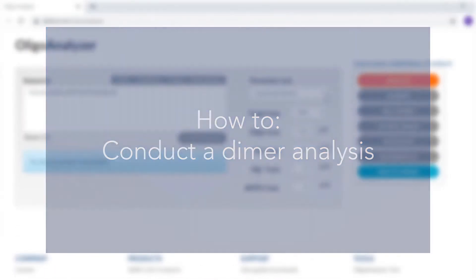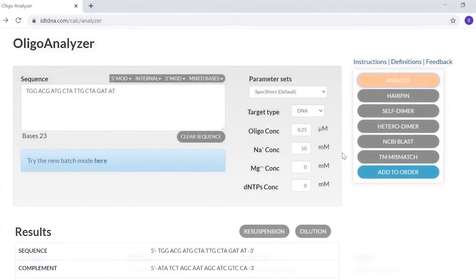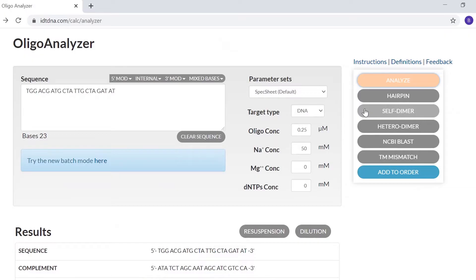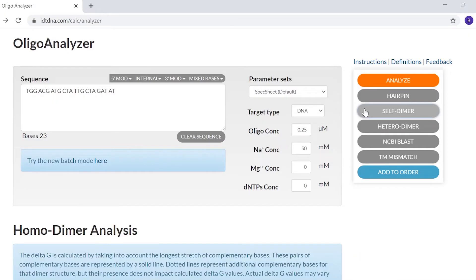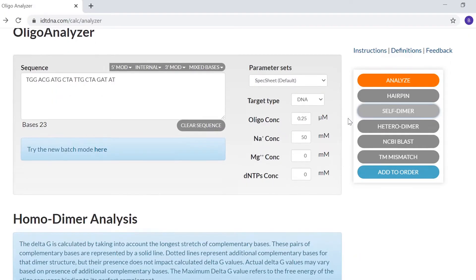To predict possible side reaction structures that can compete with the formation of the Oligo target, conduct a dimer analysis. When you select self-dimer, you will see the predicted dimer structure listed top to bottom, from the most stable to the least stable structure.